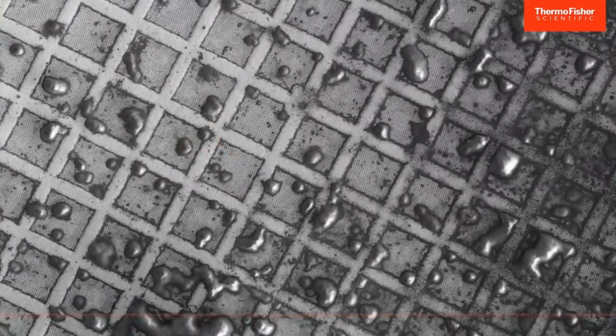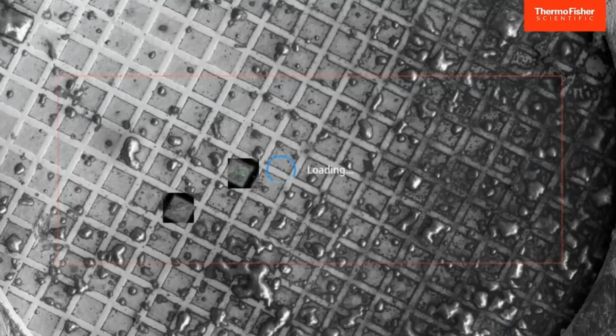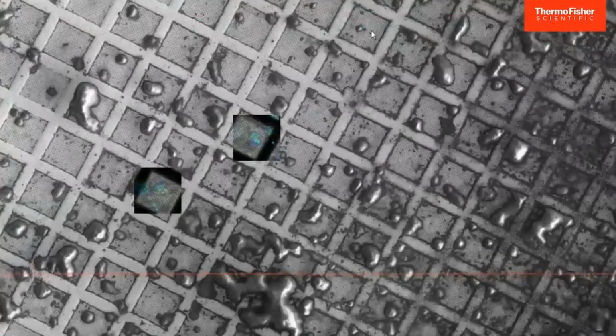It's also possible to obtain sparse tile sets with the light microscope, so you don't need to do the full tile set, but you can select certain areas where you want to take fluorescence information. Here are 2 areas marked.